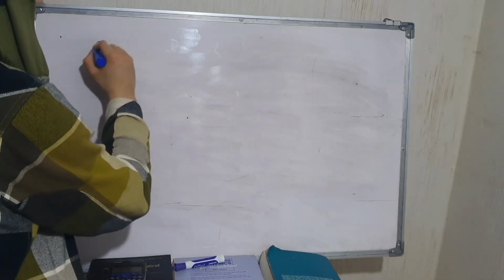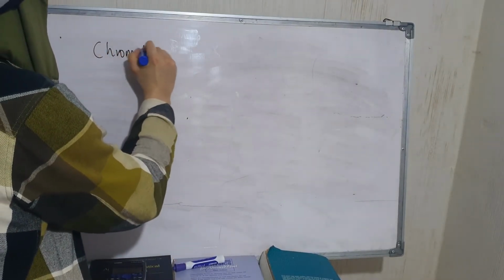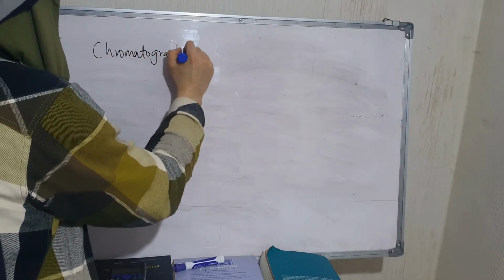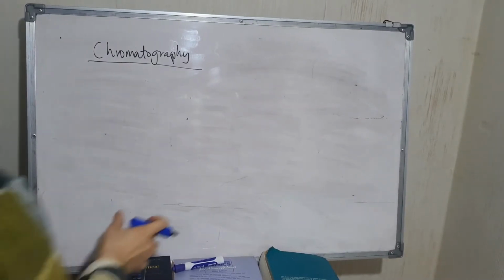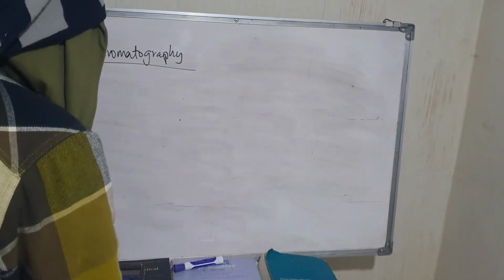We are going to be talking about chromatography. Now, let's just say that you want to investigate a substance.